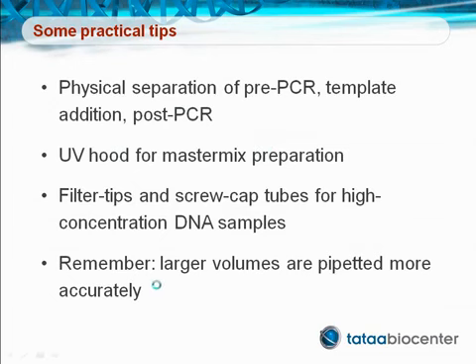When opening a regular test tube, aerosols may escape, contaminating the entire laboratory with PCR product. To minimize contamination risk, use filter tips and screw cap tubes for high concentration DNA samples. Remember, larger volumes are pipetted more accurately. Try to avoid pipetting volumes smaller than 1 microliter if possible.